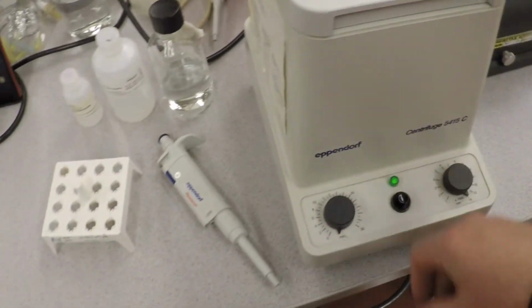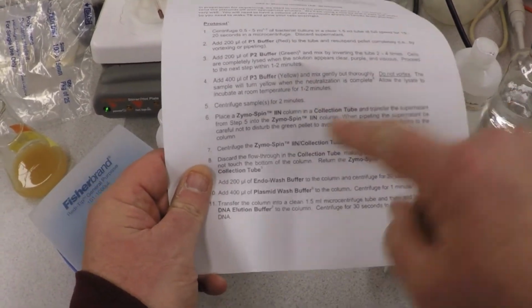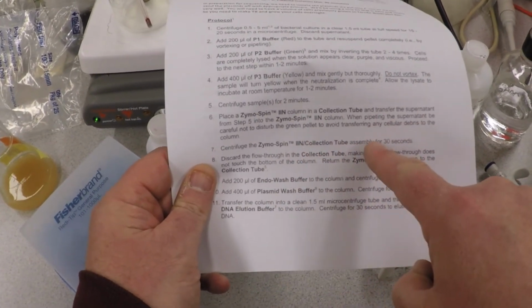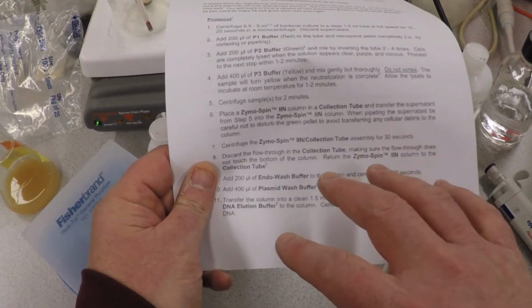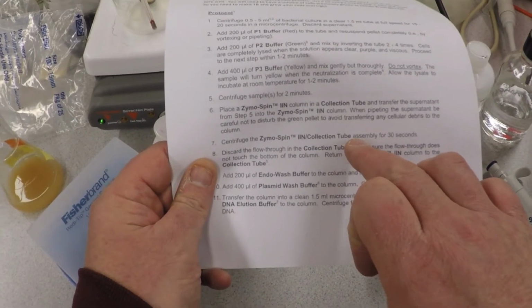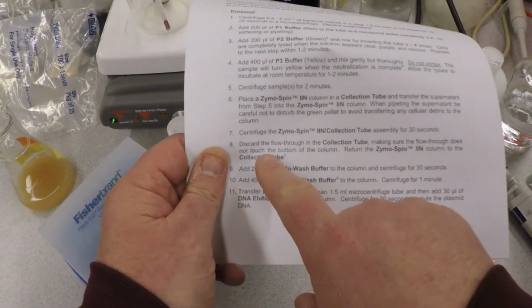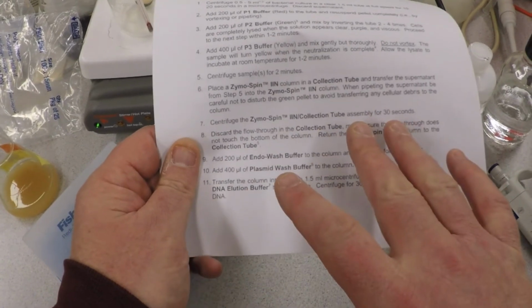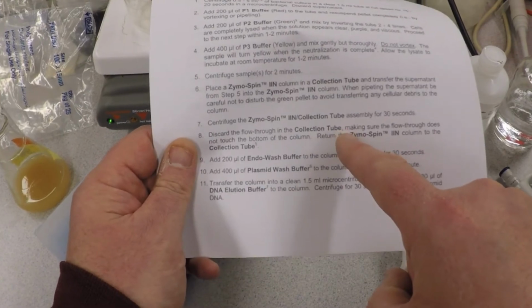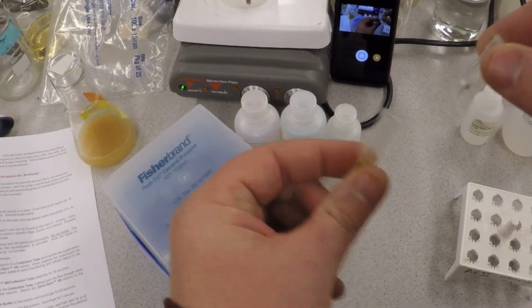That's okay. 30 seconds. In the next step, what we're doing is flowing everything through the column. And what's happening is all the hopefully plasmid is getting stuck on that white stuff in the base of that column because of charges. Because now the rest of this is basically washing. It says discard the flow through, because that's what you don't want. Your plasmid will be stuck to that white particulate stuff at the bottom of that little column. Okay, so I removed this after a 30-second spin, and it says discard this stuff.